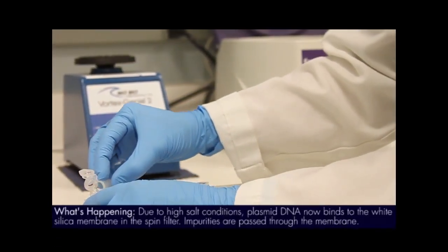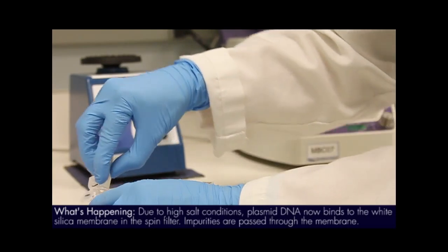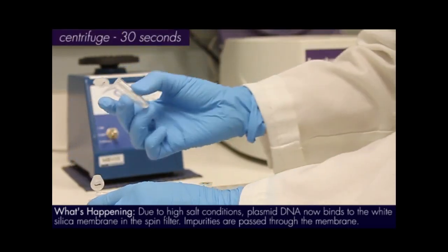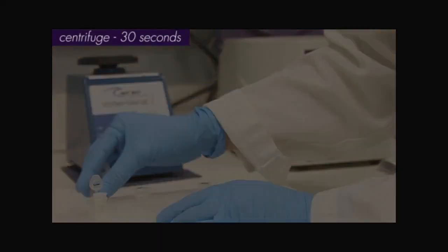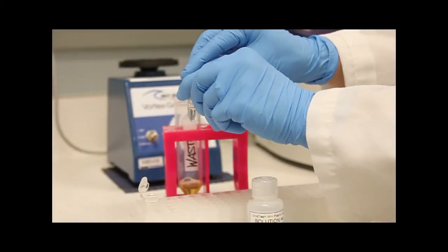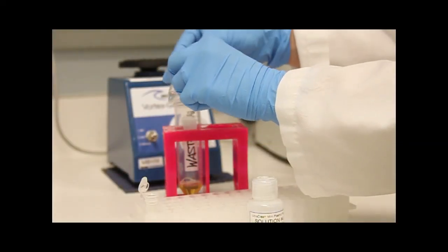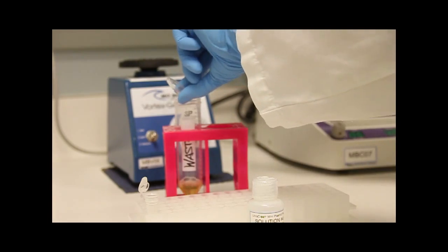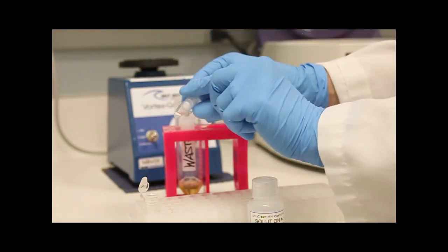Transfer all of the clear liquid supernatant to a spin filter, avoiding the white precipitate. Centrifuge the spin filters for 30 seconds at 10,000 times G. Remove the filter basket from the collection tube, discard the flow through, and replace the filter basket in the collection tube.